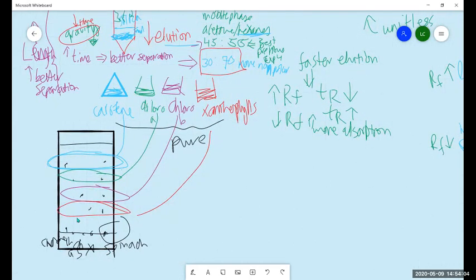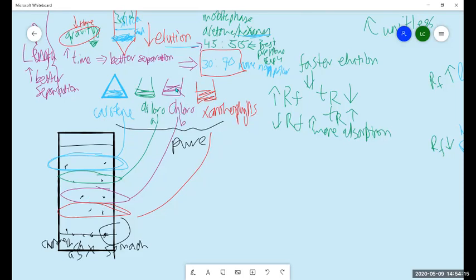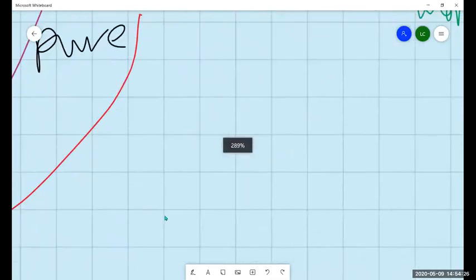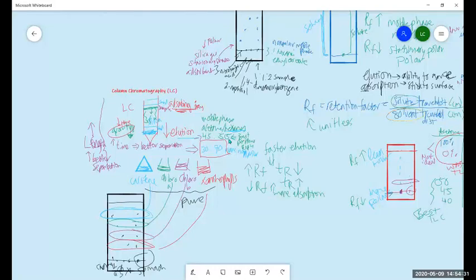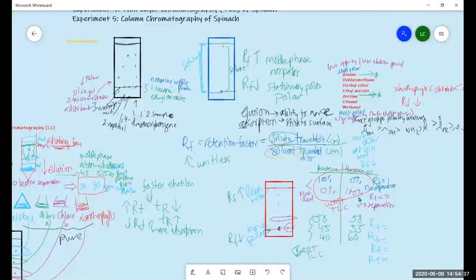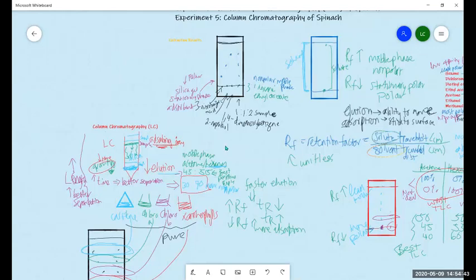And from this, if you had multiple spots, let's say I had another spot for my 4th fraction, then I know for the xanthophylls, I moved the column too early, and then I had some chlorophyll B. I didn't leave the previous vessel long enough to collect all the chlorophyll B, and some of it dripped into the xanthophylls, so I have that impurity here. You should be able to analyze things like that. So it is used as the check for purity. The TLC in experiments 3 and 5 is used to check for impurity. For experiment 4, it was used as the principle of separation, but just make sure to have that clear.